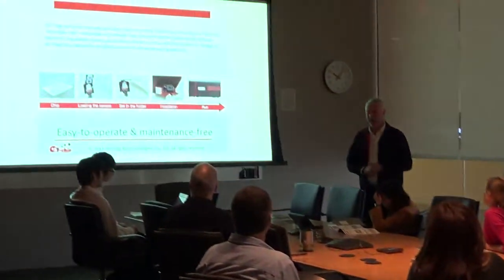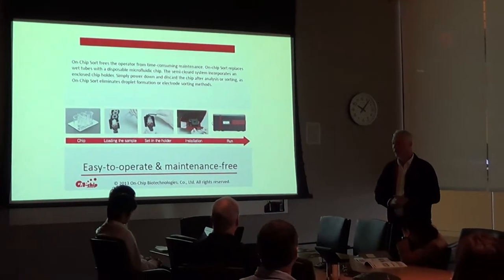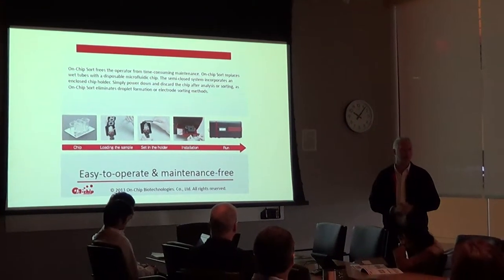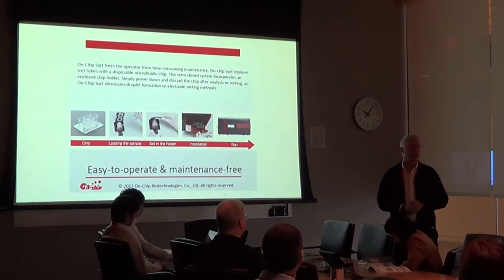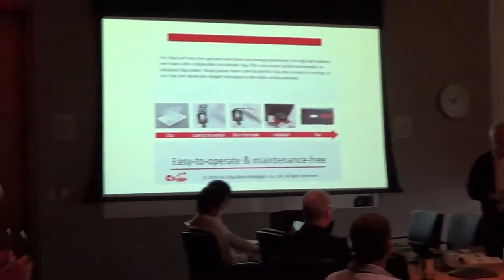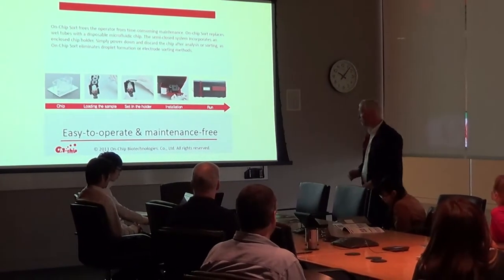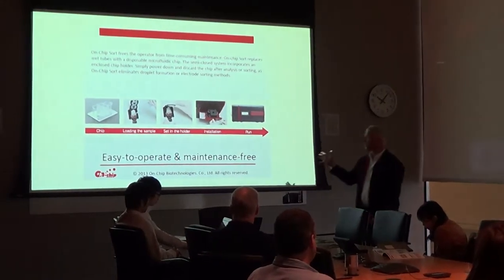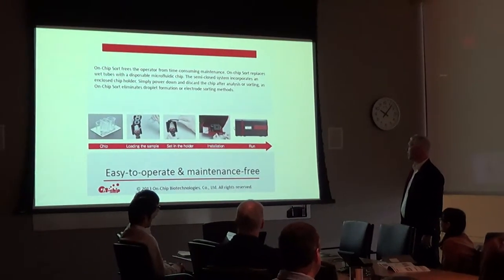and a little bit, Akagi-san's going to go through the differences with the conventional sorter, and a little bit of the architecture of the system. I'm going to start by walking through a little bit of diverse applications and where it has a home, and where we're finding a need. So, just first off, a little bit of acclimation to get familiar with the system itself.